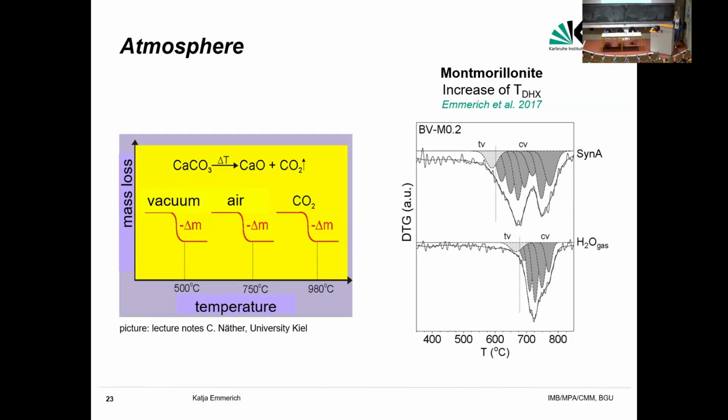And this you also have to consider when you perform only TG measurements, and then there you have the opportunity to use very large crucibles. Normally you can use like 100 milligram during a thermal analysis, but for TG measurements there are also crucibles available that can hold up to 5 grams of material. And this sometimes might be helpful if you have very heterogeneous materials, or if you want to study aggregates or compacted samples and you don't want to destroy the sample before you perform thermal analysis.